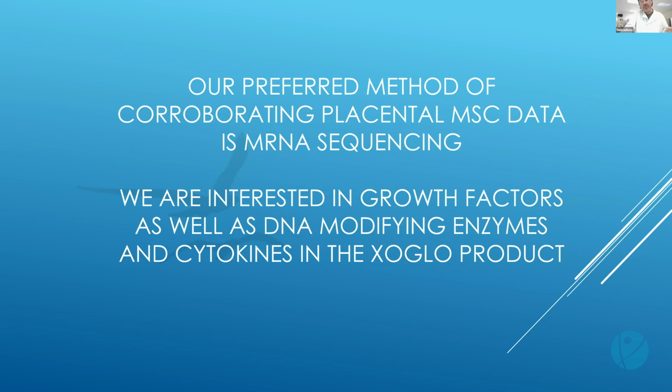When you try to get proteins from exosomes, really remember the exosome is protecting the proteins. So if you throw an antibody in there for an ELISA, it can't see what's inside the exosome. So I actually had to make up my own protocol to open the exosome so that I could see those proteins, and take 2 different experiments and put the numbers together. So it's not a really reproducible way of doing it.